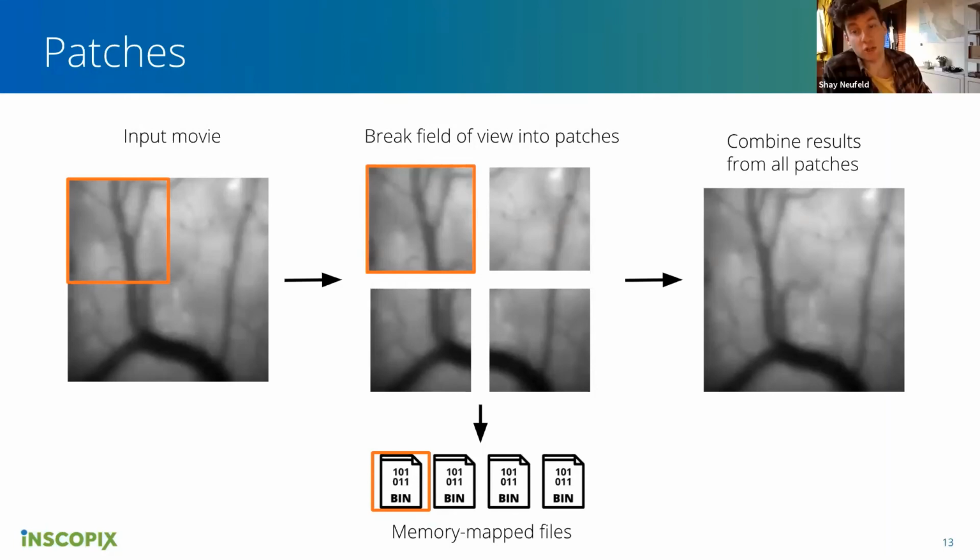And actually, there's also an individual background estimated for each neuron as well. Yeah, I mean, it goes even further. It identifies the background for every pixel. Every pixel, yeah, that's true. And then we also have it for every neuron afterwards when we're combining them into neurons. So the background estimation is pretty cool, and we have some more information about that in the manual.